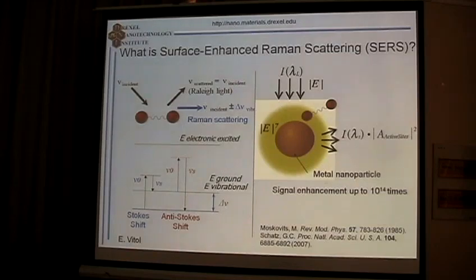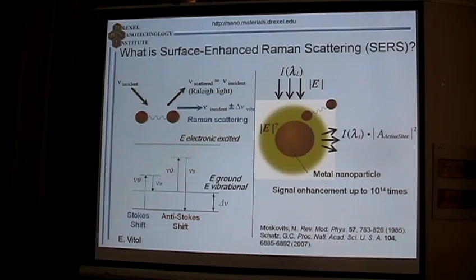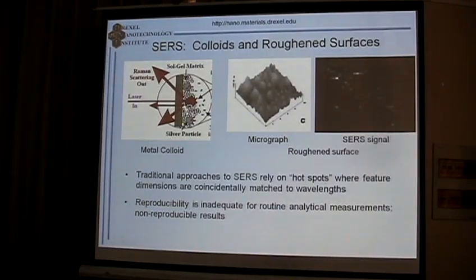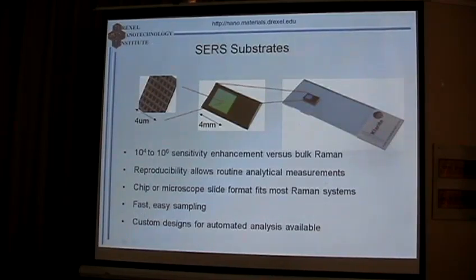So we can use it for two purposes. One, for example, you can look at a very small number of certain molecules or functional groups on the surface of carbon nanotubes that you cannot detect otherwise. For example, in the beginning I mentioned one of the challenges people face is how to determine, for example, defects, oxygen, hydrogen, other atoms on the surface of carbon nanotubes. Raman spectroscopy can help. But what, for example, Elena is working on, she develops probes that are based on carbon nanotubes, contain gold particles on the surface, and can be used for probing the environment here.